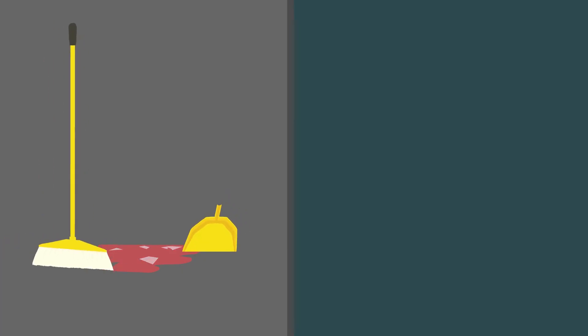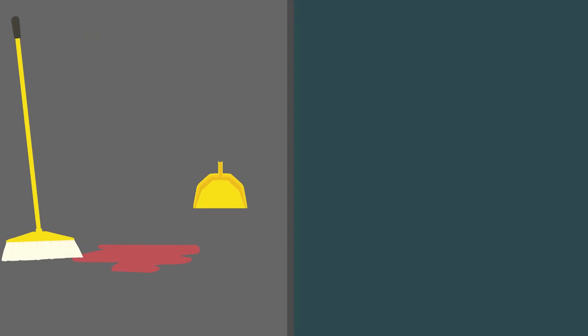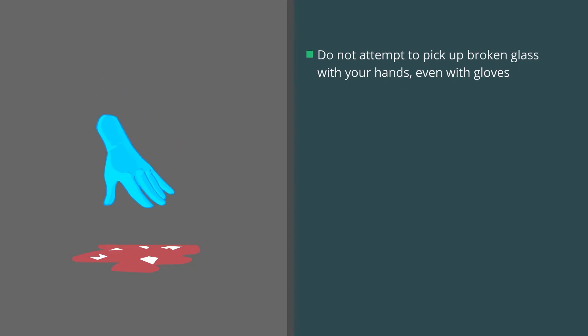If the spilled material includes broken glass or other sharp objects, be sure to use tools such as a broom or brush and dustpan or tongs. Do not attempt to pick up broken glass with your hands, even if you are wearing gloves.